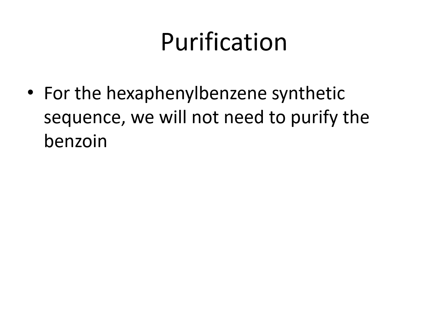So we are on the mechanism to synthesize hexaphenylbenzene, as I explained in the beginning, because throughout all the previous 4 experiments, we have been doing the first pass to synthesize the hexaphenylbenzene, and then we're starting the second pass here.